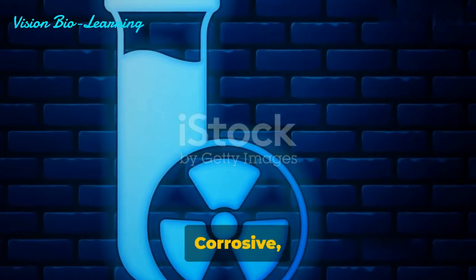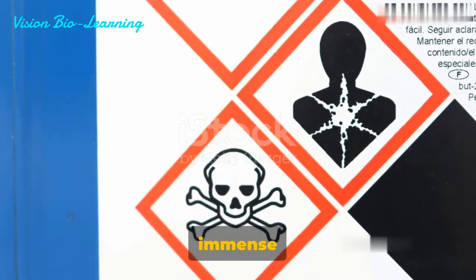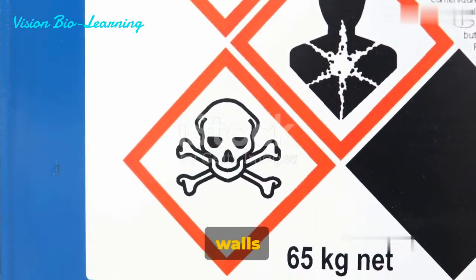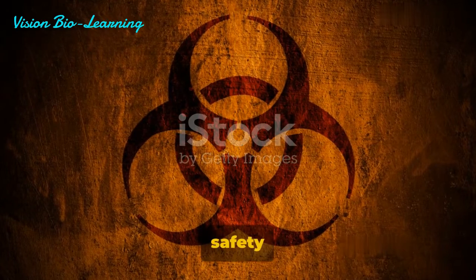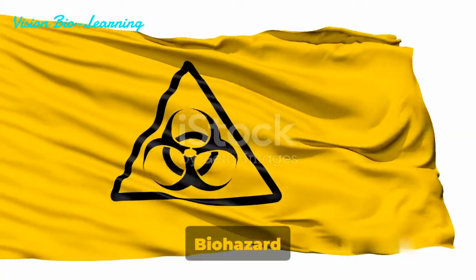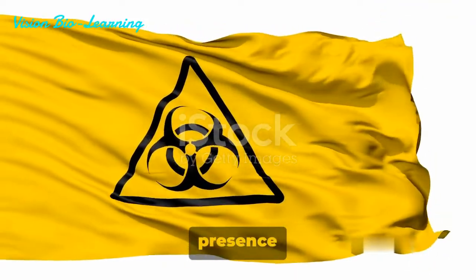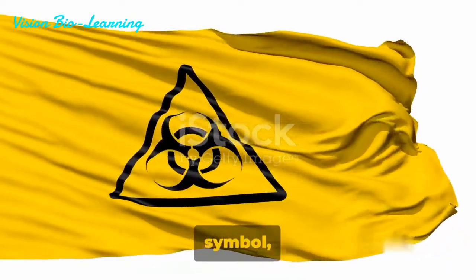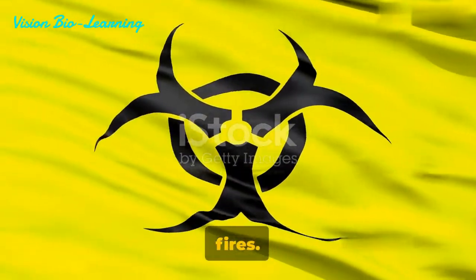To recap, we've covered the biohazard, flammable, corrosive, and radioactive symbols. Each of these signs holds immense significance in a laboratory setting — they are not mere decorations, but critical instructions and warnings that guide us to ensure safety and prevent accidents. The biohazard symbol, with its unique triple-curved design, alerts us to substances that can pose a threat to human health. The flammable symbol cautions us about substances that are easily ignited and can cause destructive fires.